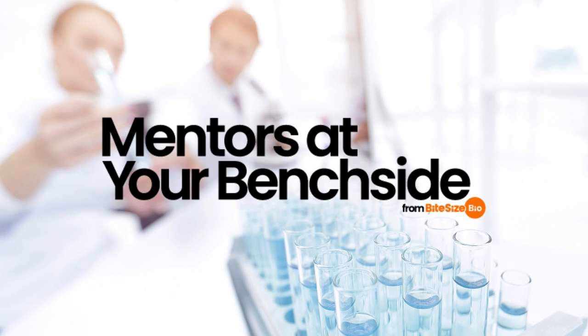Why accurate hepatocyte counts matter. Many assays require a precise quantification of cell numbers for cell seeding purposes and to allow the normalization of data between different assays. An accurate hepatocyte count is imperative because of their various important biological applications, including drug testing and development. Accurate hepatocyte counts ensure the correct dosage in drug testing, affecting the efficacy and toxicity measures.